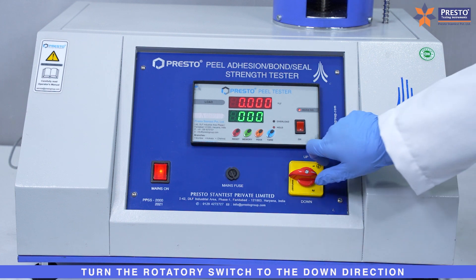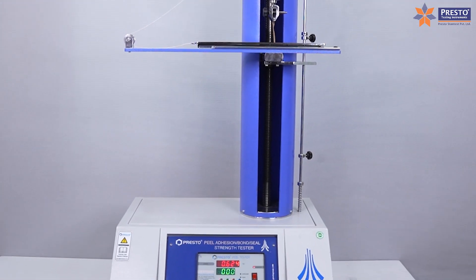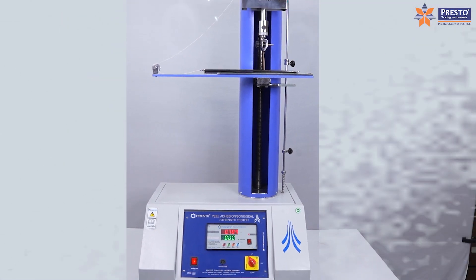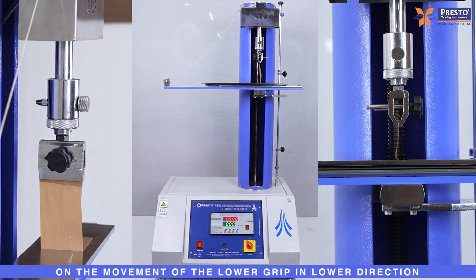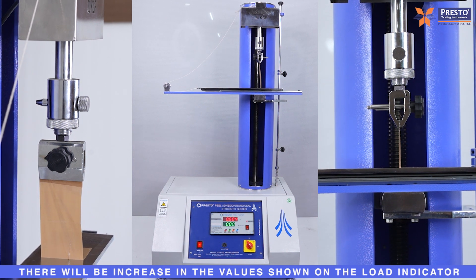Turn the rotary switch to the down direction. On the movement of the lower grip in the lower direction, there will be an increase in the values shown on the Load Indicator.